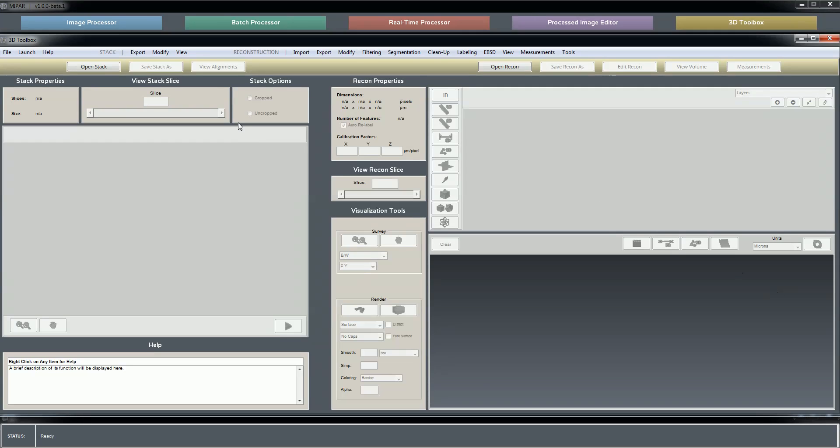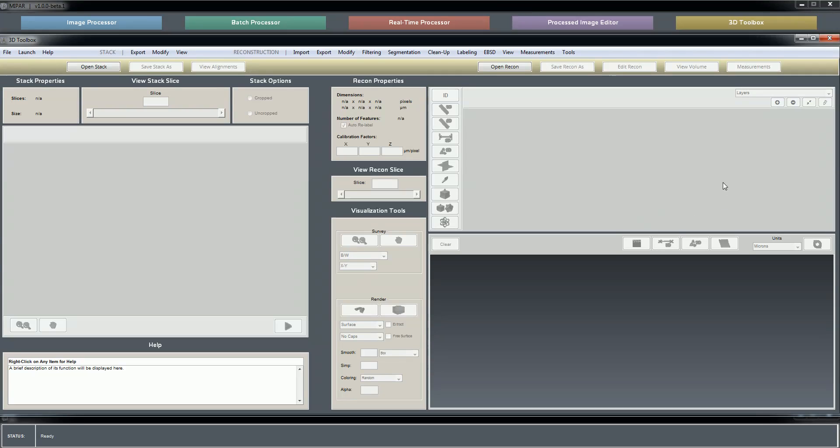The image stack for a typical serial section dataset, say collected in a dual beam FIB, will look in the unprocessed state pretty identical to the reconstruction, since your sequence of images, which is all the image stack is, looks like the reconstructed volume when you slice through it one XY slice at a time in your reconstruction.